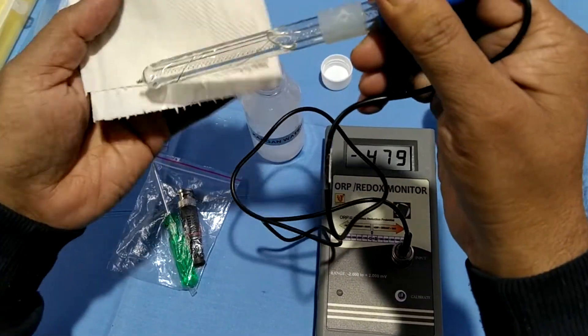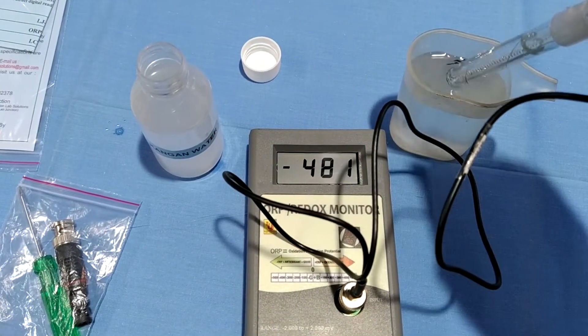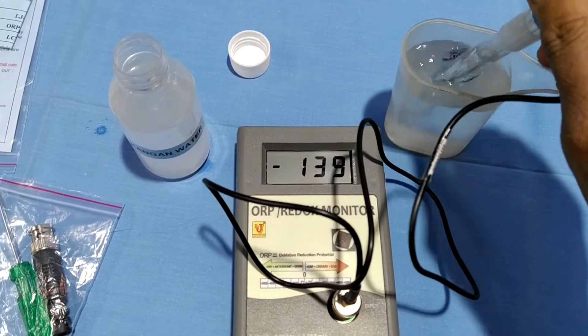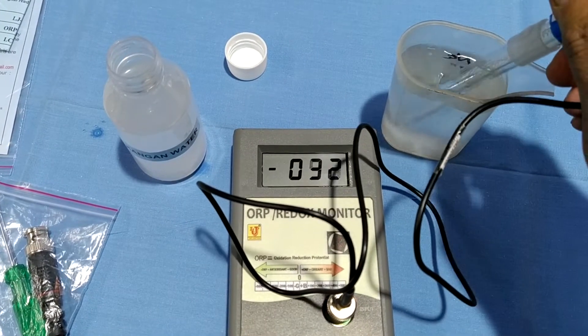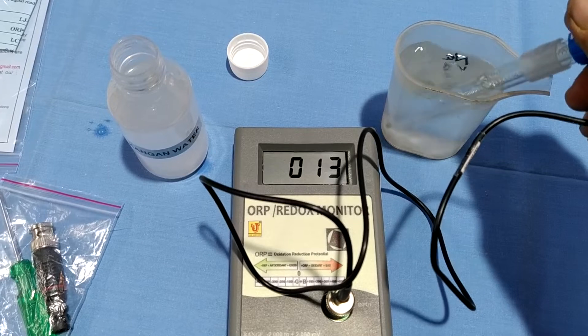I am changing the sample. This is hot water directly from the tap.